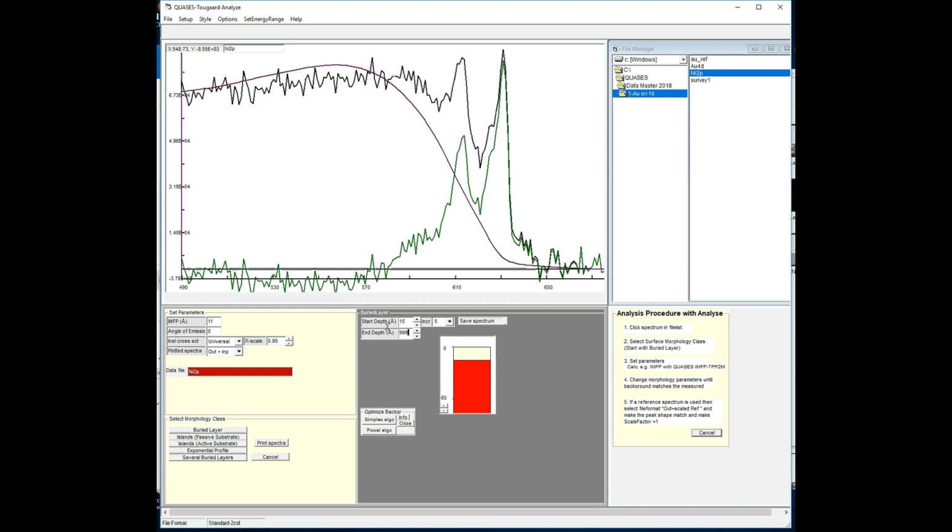So when we compare to what we had with the gold 4D analysis, where we had 2 islands, we had the tall islands of 150 and the small islands of 15 angstroms height. Here we only find 15 angstroms.